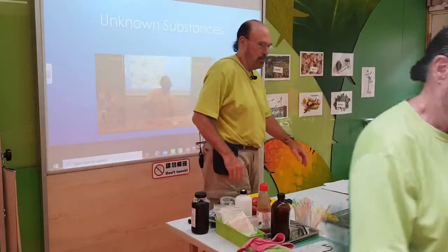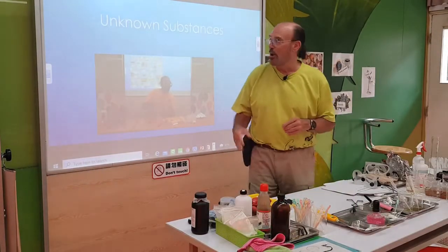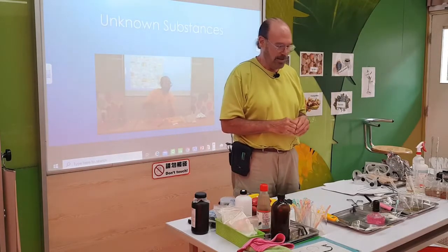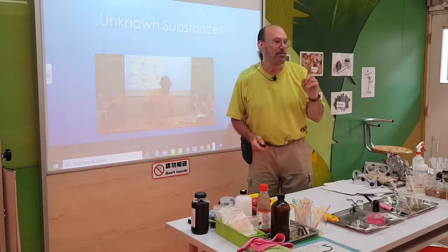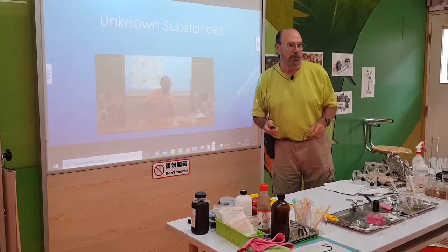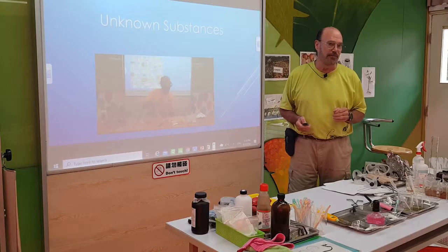So let's get started. Okay, so welcome to Science Lab. The name of this lab is called Unknown Substances. So today we're going to take a look at some different substances and try to guess what they are. But let's take a look at the PowerPoint first and see what the vocabulary is for today.